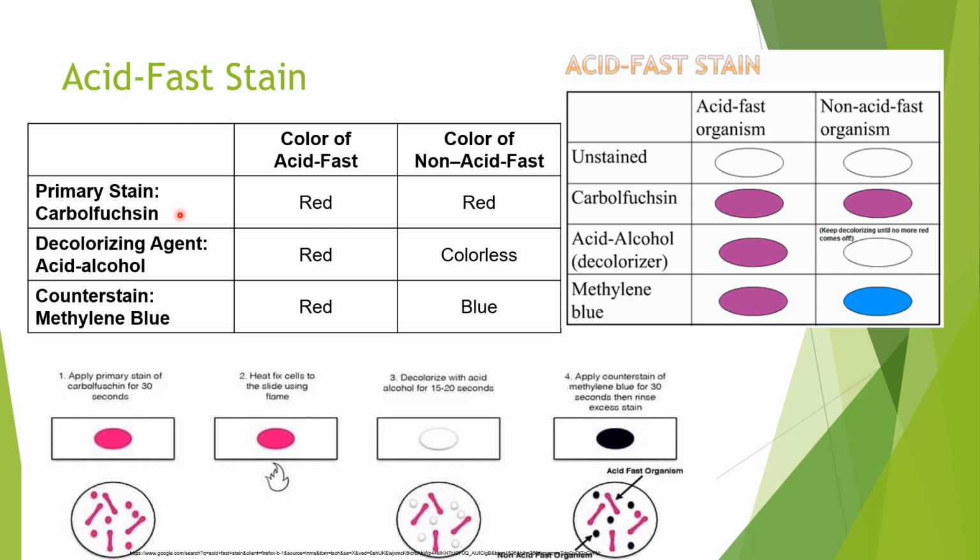Better. And then you go ahead and decolorize with acid alcohol, not ethanol. It's acid alcohol. By the way, with each procedure, you've got to make sure that you are using the correct decolorizer, because if you're not using the correct decolorizer, things are going to go wrong. Now, the ones that do have the waxy layer are not going to be decolorized. They're going to maintain that red color.